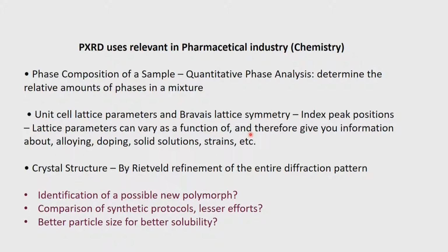Remember, when we did the indexing, we read out the peak positions. We did not bother so much about the way in which the peak is appearing, the shape of the profile, and so on. But it is important that we use the shape of the profile, because the shape of the profile definitely represents the integrated intensities. So, it is the integrated intensity we will need in order to determine the structure, because we already know that structure is along the y axis of the powder diffractogram, and therefore, we have to analyze these profiles extremely carefully after indexing those patterns.